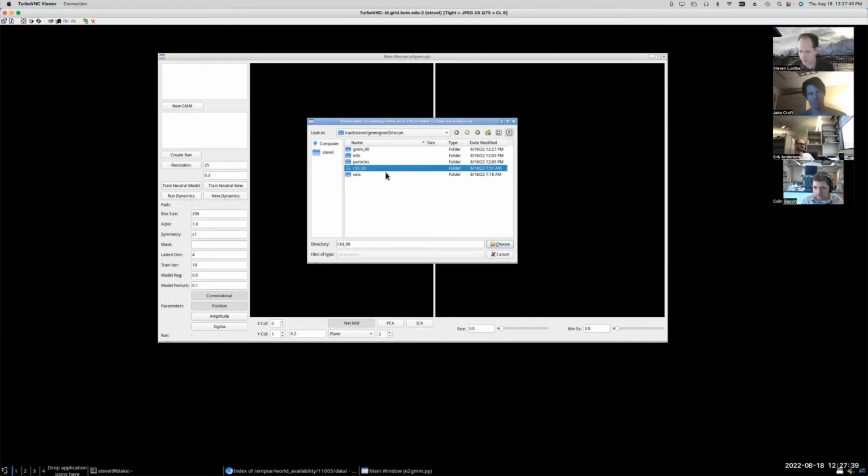So if you're doing subtomogram averaging, it will now not break if you try to use it with a subtomogram average, although still some work needs to be done to get the results optimal. So you pick the folder like that, and then it will automatically process the contents of the folder to sort of seed this Gaussian mixture model process. This isn't doing the network training or anything like that. It's just setting up the project as a whole.